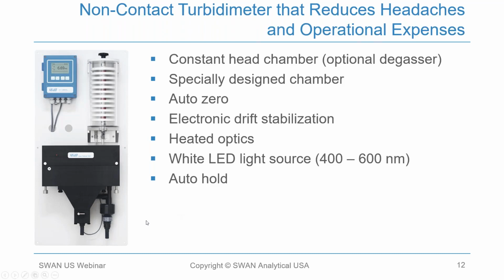I once had a manufacturer come in, they were doing my quarterly calibrations. They put the unit in a manual hold. They forgot to put it back in the run mode when they left. The unit was sending the held signal, so the operators didn't notice it for a few days, and we ended up getting a violation because of it.